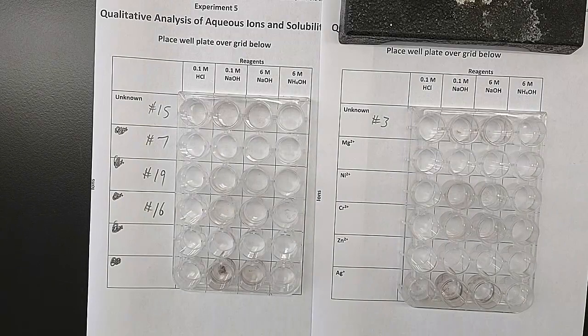Qualitative analysis and solubility. We can old school determine the identity of a material by matching it to materials that we do know, matching it to the chemical behavior of materials that we do know.